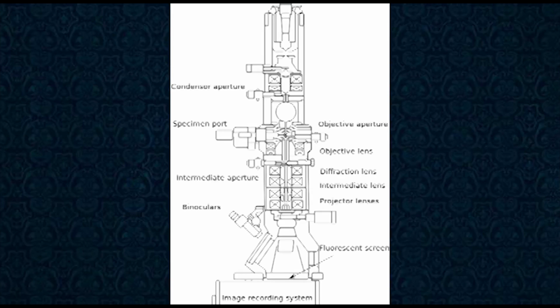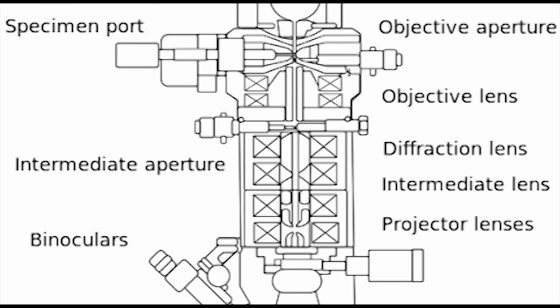The electron beam lenses are actually variable electromagnets which, as one would expect, produce magnetic fields. Using these, one can adjust the position and focus of the electron beam to interact with the sample as needed. In addition to the magnetic fields, electrostatic fields are also used, which deflect electrons at a constant angle as opposed to the varying angle of deflection achieved via use of a magnetic field.